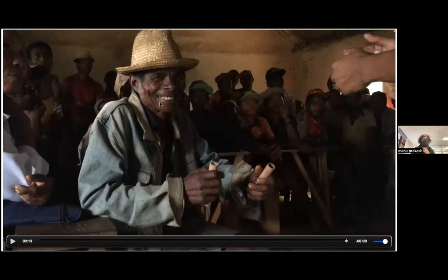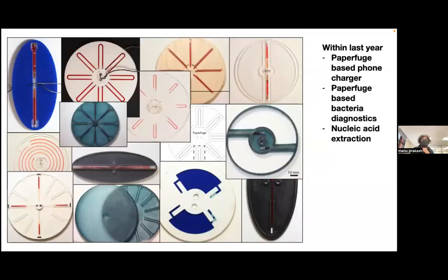So once we released this, something really fun happened, which is, within a couple of years, lots of other new designs. I mean, many of these are ours, but there are also all kinds of them online. And then any one of you can start building. So there are 3D printed versions of these that lock as little discs. There are large, high volume ones, because initially I was talking about just capillaries, so they are small volume. This is for urine-related samples where there's a much larger volume.